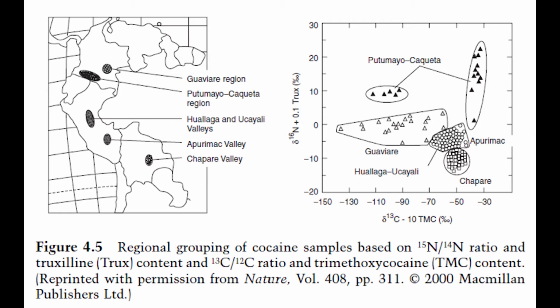If it came from a leaf in Central South America, then the leaf was consistent, and everything that comes from it, the cocaine and everything else, is consistent with the carbon and nitrogen ratios from that region. So you can take powder cocaine or crack, combust it into CO2, and then look at the isotope ratios.